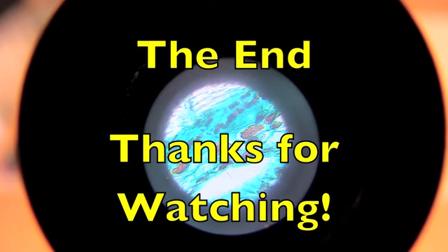So I think the image quality of this is just spectacular. It's probably not coming across in the video. And I apologize for that. But I wanted to show you a view down through the microscope at least a little bit.